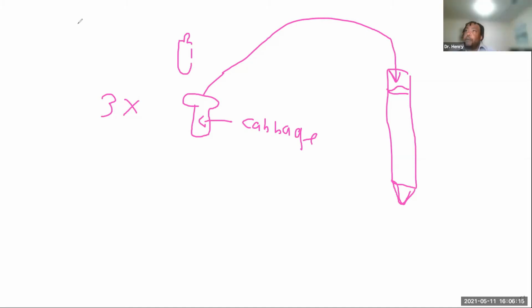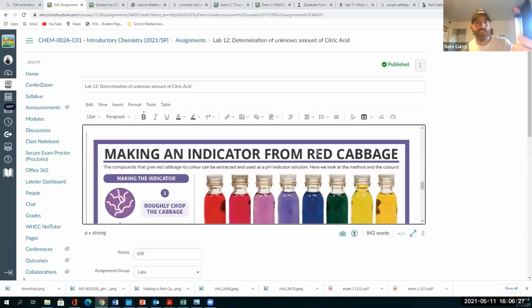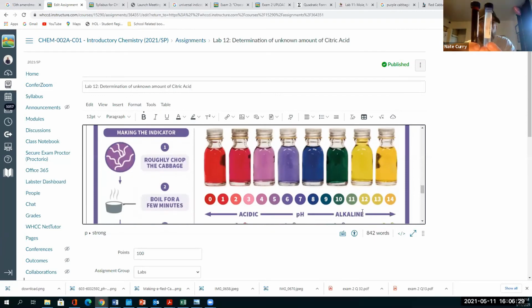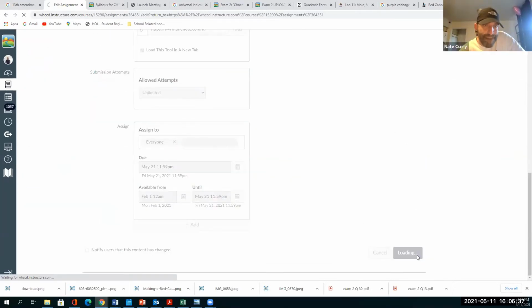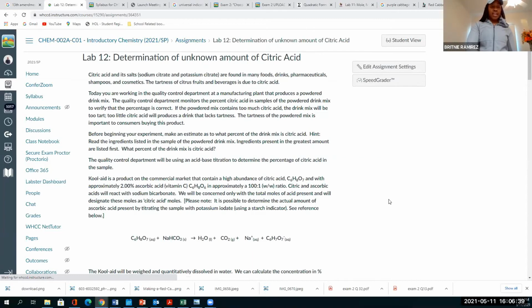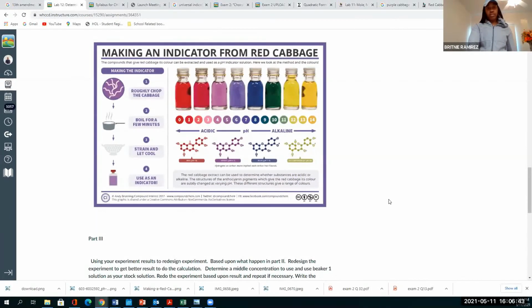Yep. So I'm going to put up on the screen the cabbage indicator at the different pHs. Let me share my screen. Hold on. Was I supposed to get 2 of these tubes? Because they gave me 2. Yeah, you are. Oh, shoot. Mine is way darker than all of those. For us, if it doesn't react at all and just stays that cute purple color, then what?